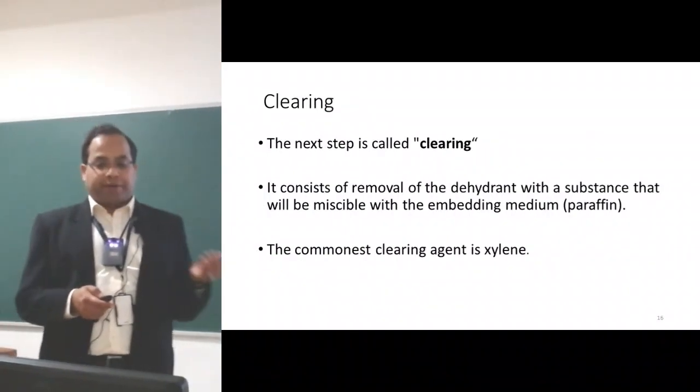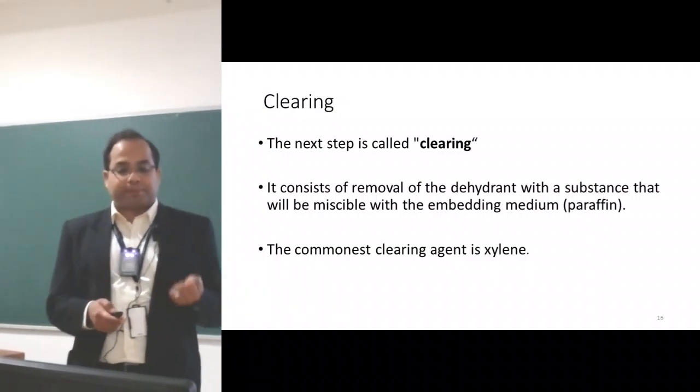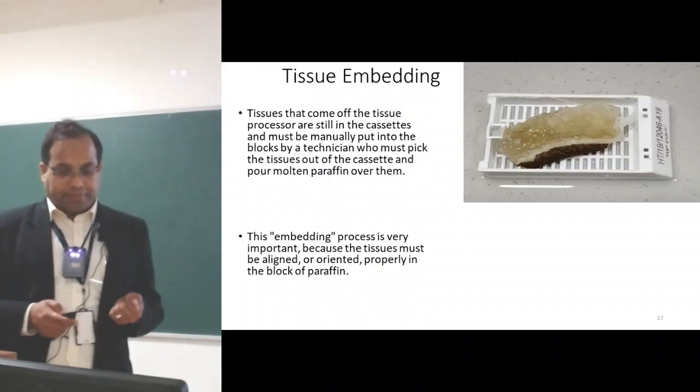Then comes clearing. It consists of removal of the dehydrant, that is alcohol, with a substance that will be miscible with the embedding medium or the paraffin. The commonest clearing agent is called xylene.